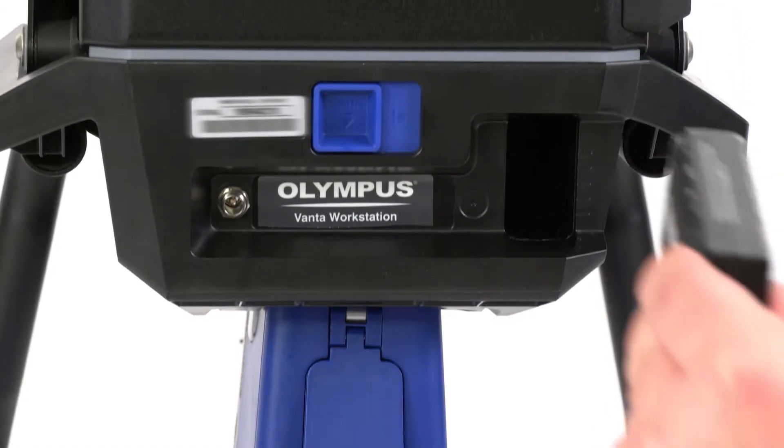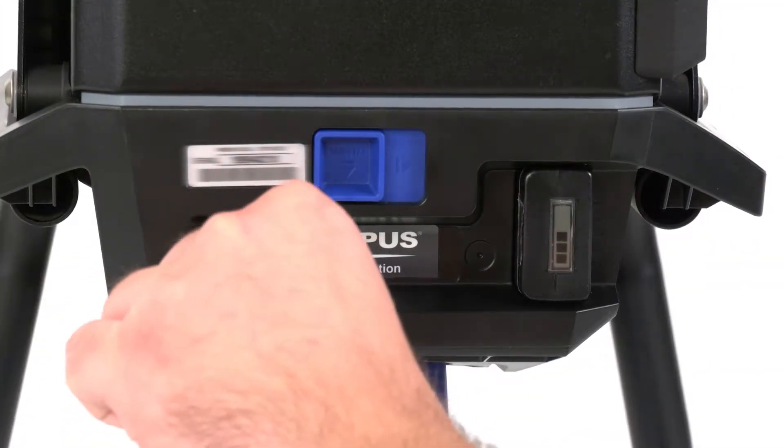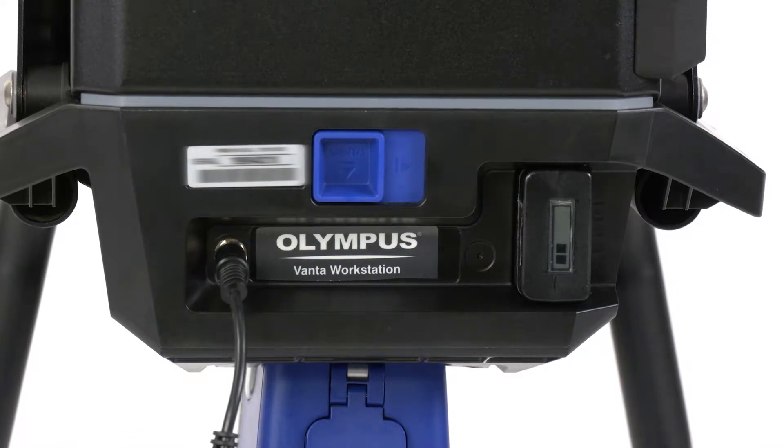The unit works with either battery or AC power. AC power charges both the battery in the Vanta analyzer's handle and the battery in the workstation.